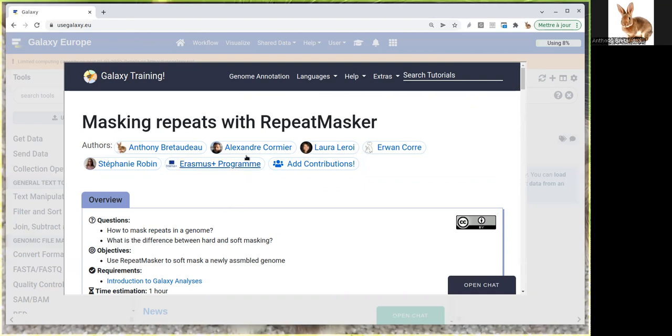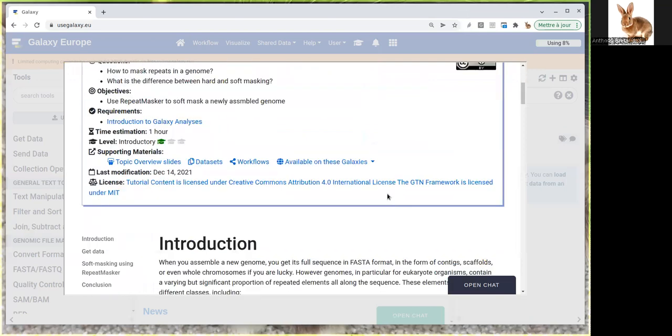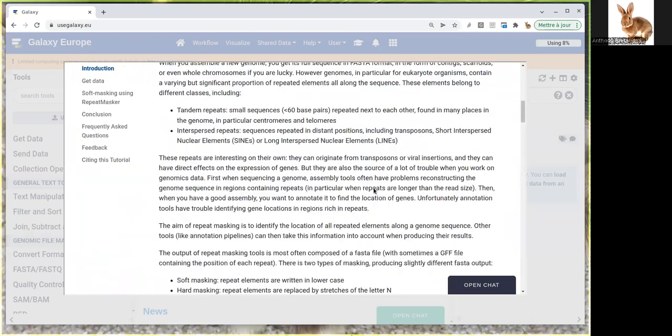There are two very used databases. The first is RepBase, but it's not free. Another is DFAM, which is free and what we'll use today. We can start the tutorial by following this.